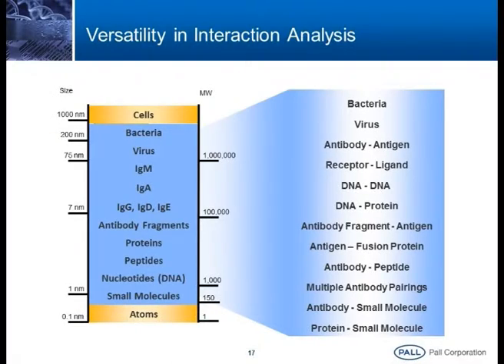So we can work with a versatility of interactions except cells and atoms. Whatever is there in the blue, all things are possible here. Cells are in terms of micron size; if you look at the surface of the sensor, it can hardly hold 3 or 4 cells. It's very difficult to work on cells. Rest, you can even have publications on bacteria, entire bacteria, virus and all, 0.2 micron, such kind of applications we can work.